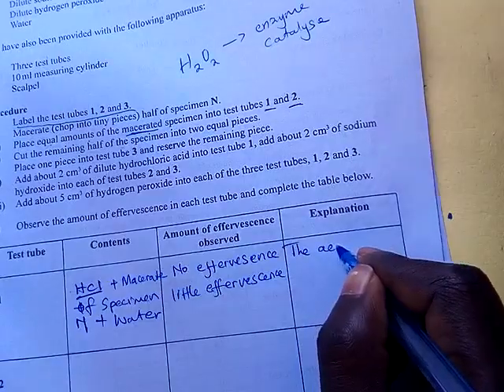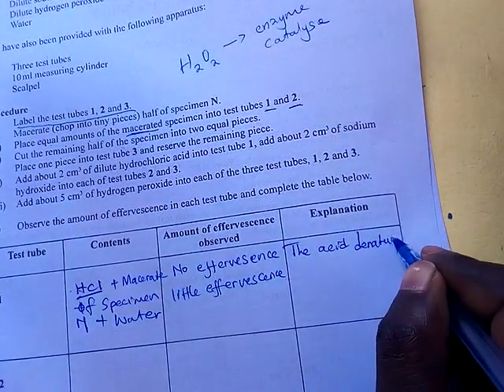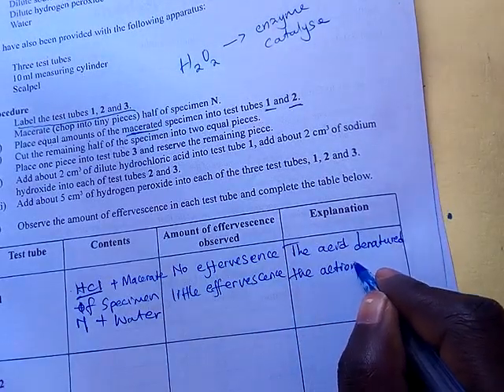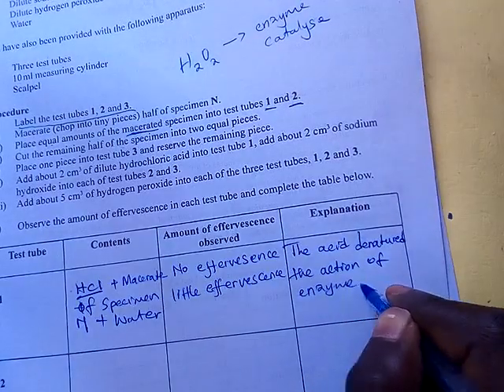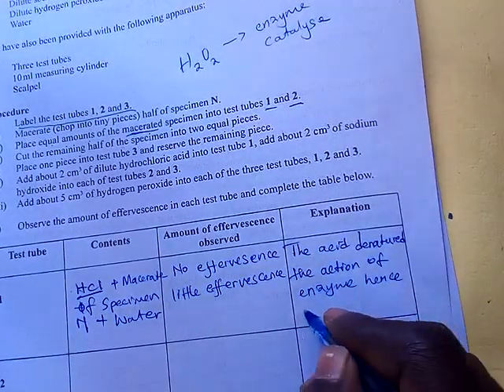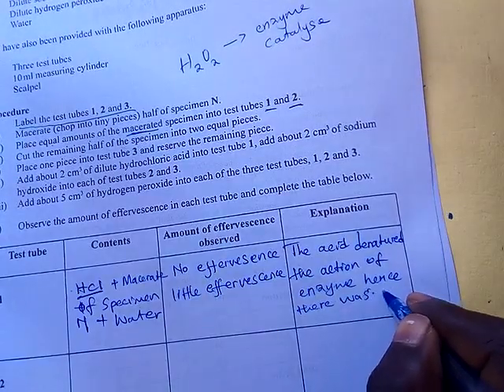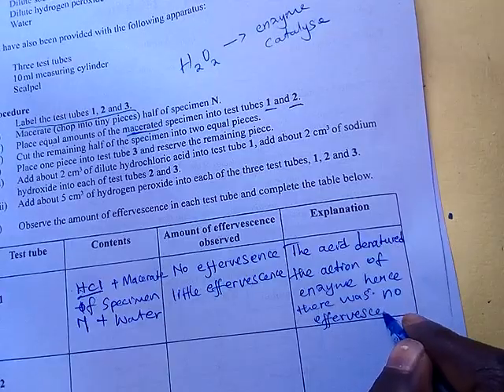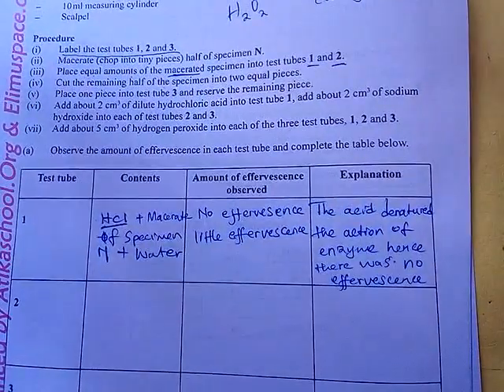The acid denatured the action of enzyme, hence there was no effervescence. Understood? Let's go to test tube 2.